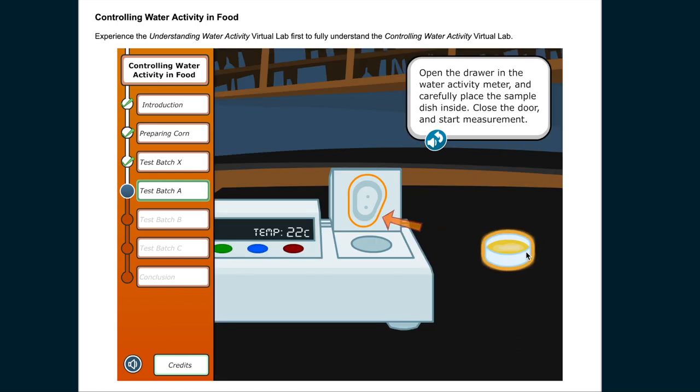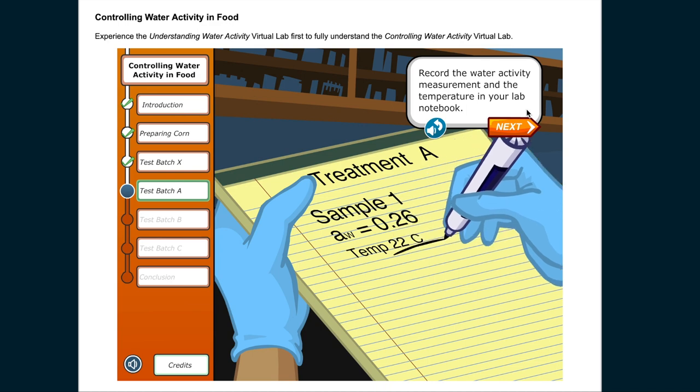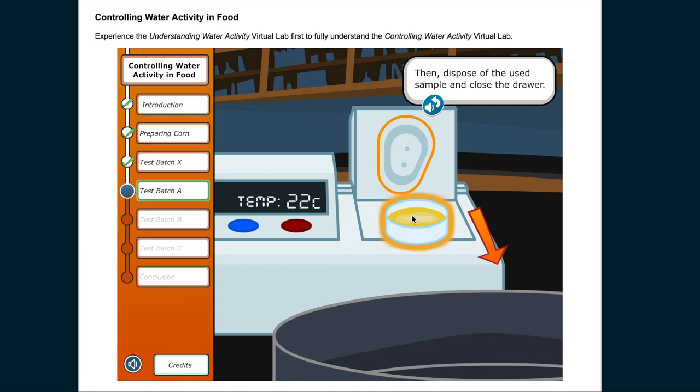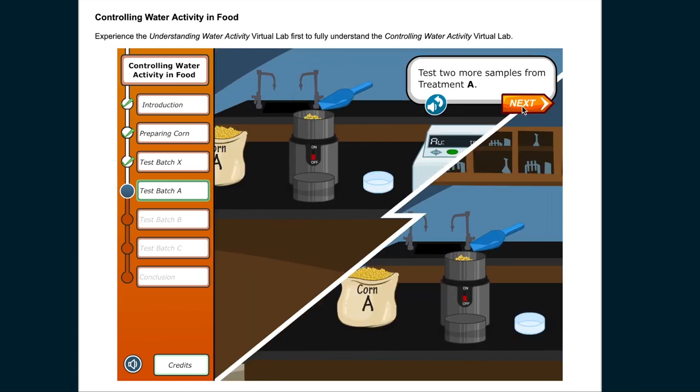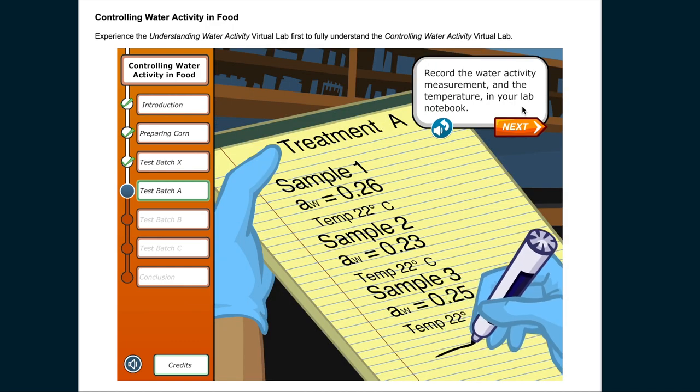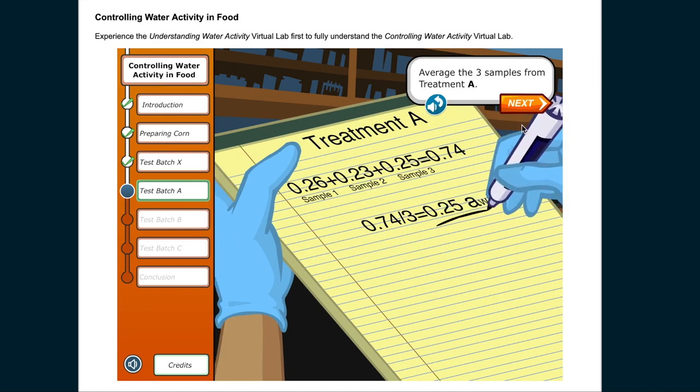Open the drawer in the water activity meter and carefully place the sample dish inside. Close the door and start the measurement. When the meter beeps, the measurement is complete. Record the water activity measurement and the temperature in your lab notebook. Then dispose of the used sample and close the drawer. Test two more samples from treatment A. Record the water activity measurement and the temperature in your lab notebook. Average the three samples from treatment A.